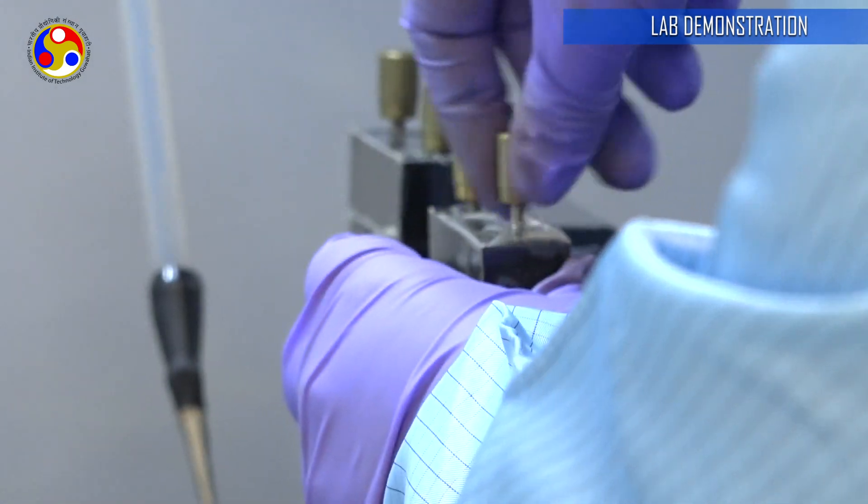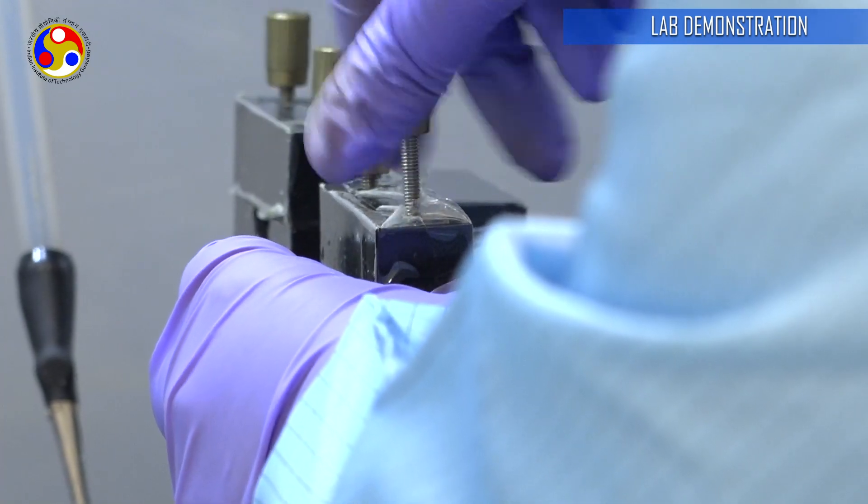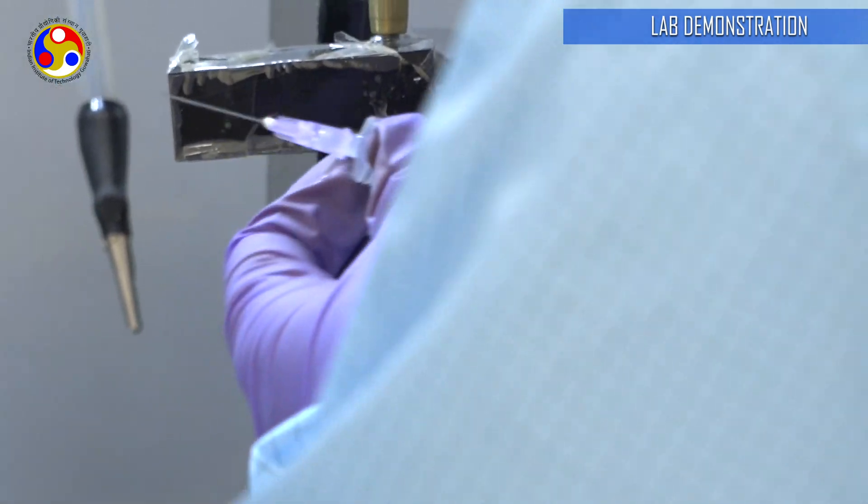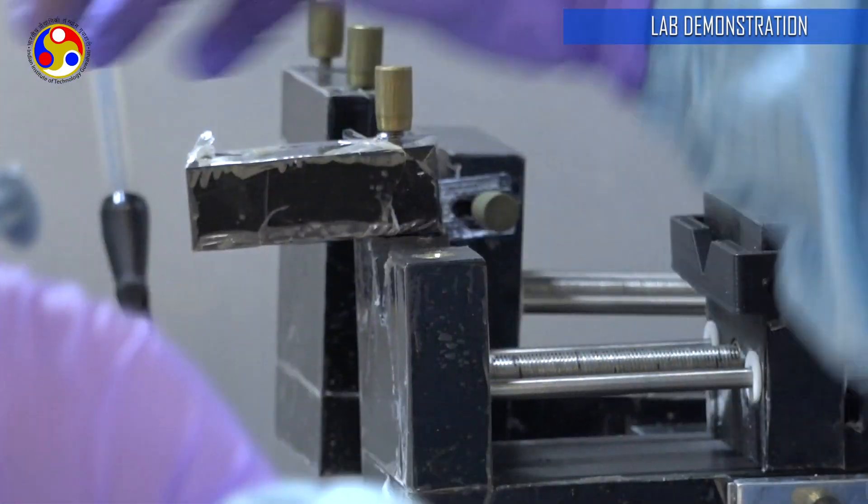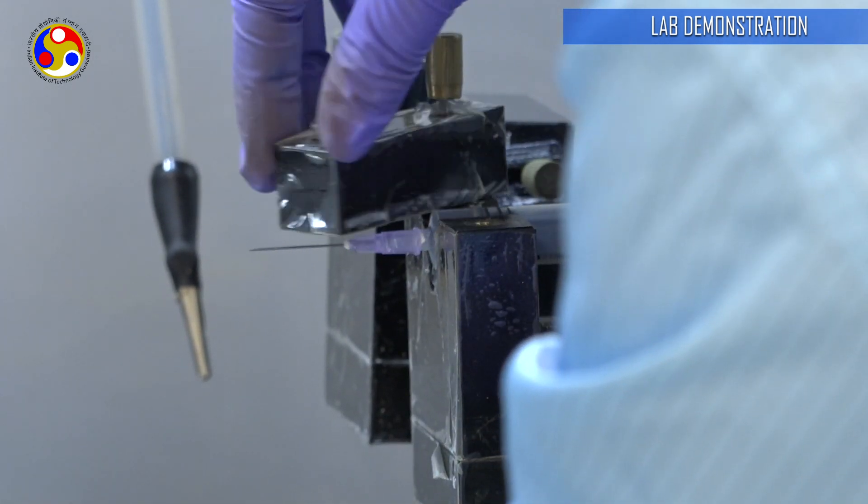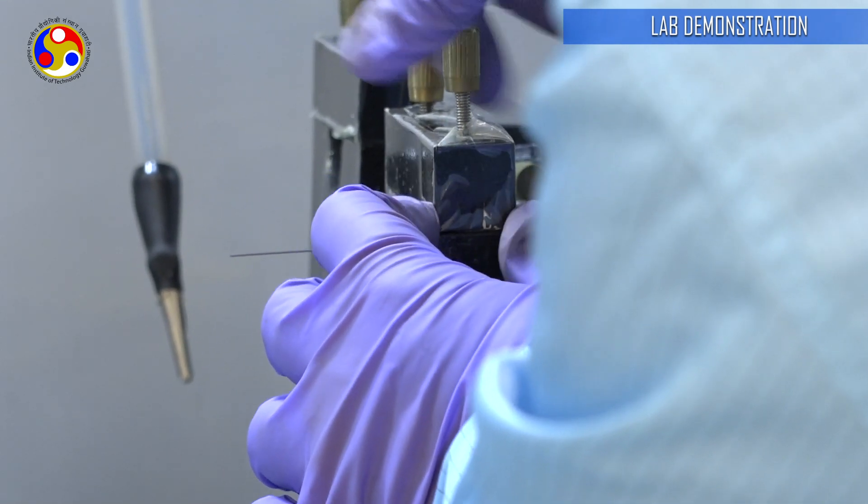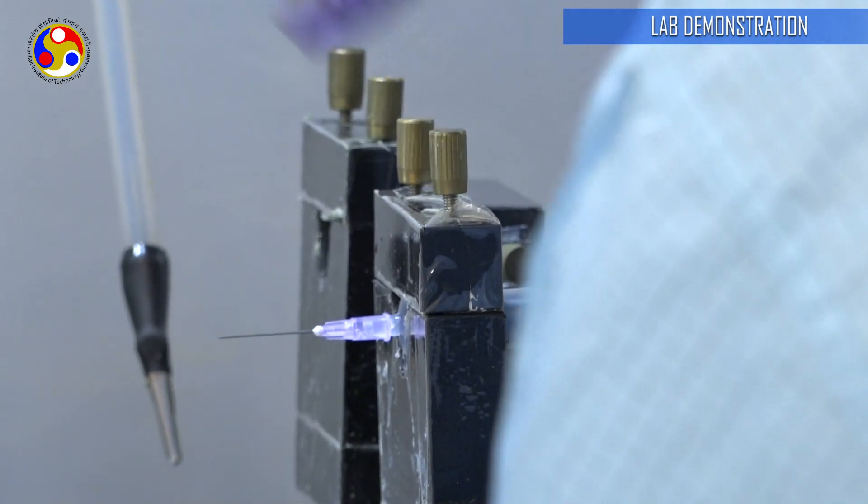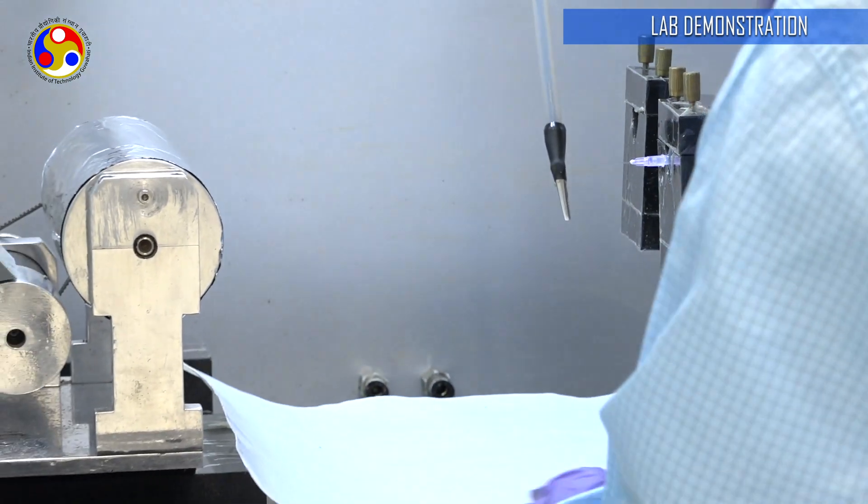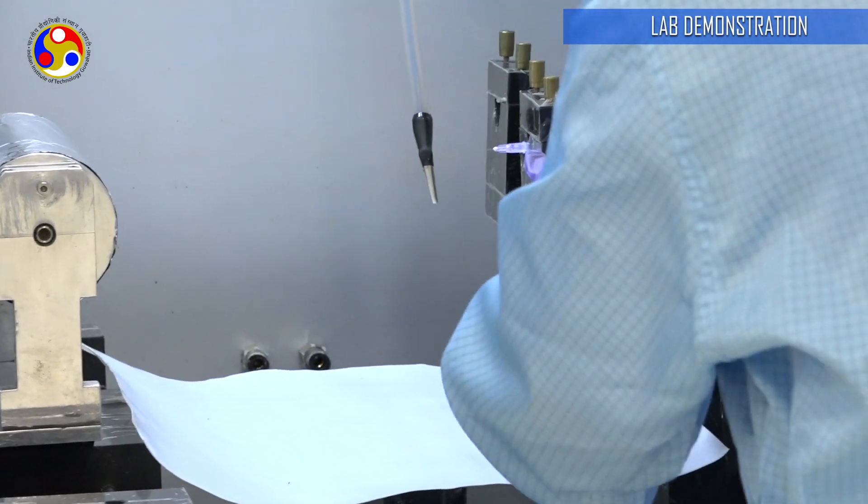I am just going to remove the screw over here at the top. I am removing the cap and I am going to put this part of the piston at this gap here so the piston can push it. I am just going to screw this back. I am going to use this cover here to ensure that none of the sample drops onto the floor of this machine. This will ensure that the syringe stays fixed.